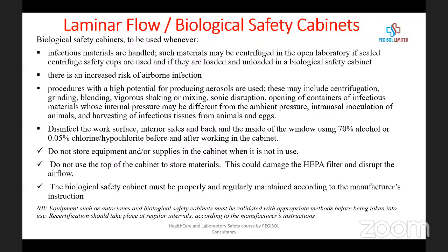And it's worthy to note that the biosafety cabinet must be calibrated. It has to be calibrated at least once a year, or anytime it is being moved, or anytime you feel that it's not giving the desired output. So you have to calibrate it, and there must be a certification for that calibration, showing that the biosafety cabinet has been calibrated and has passed calibration. When the biosafety cabinet is no longer passing calibration, it is expected that you no longer use it. It is no longer a biosafety cabinet, it is just a cupboard.